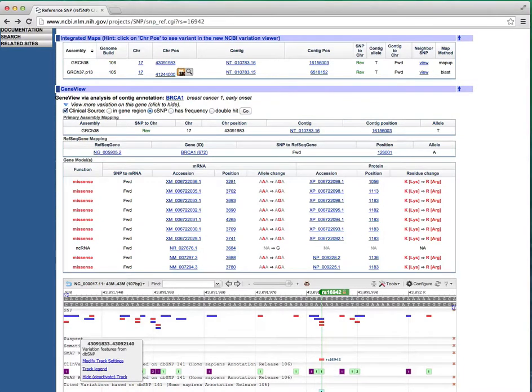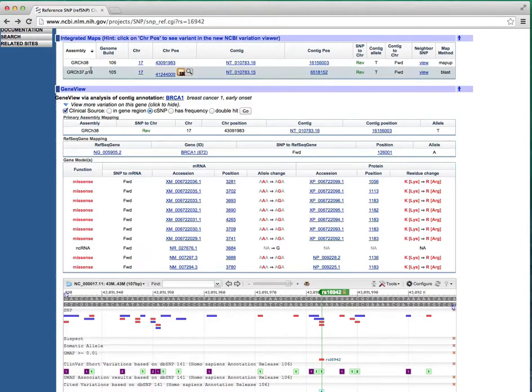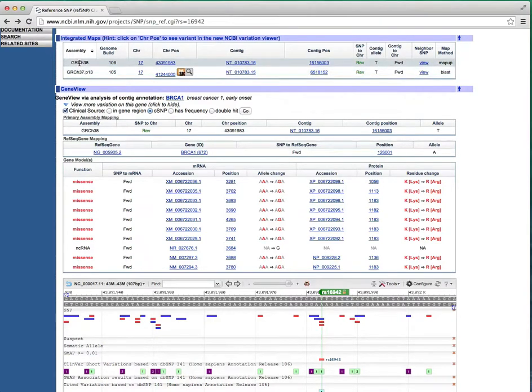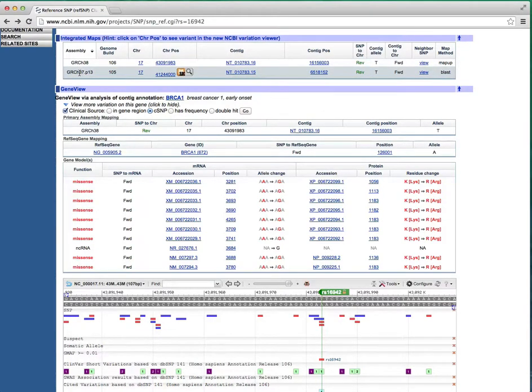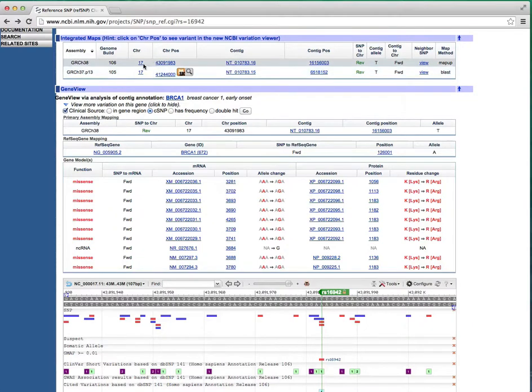The next section, Integrated Maps, shows the chromosomal position of this SNV on different assemblies. The GRCH38 and GRCH37.p13 entries display the chromosomal position of this SNV on Build 38 and 37, respectively.